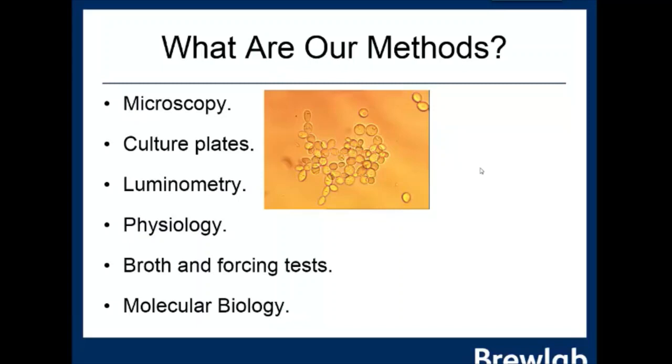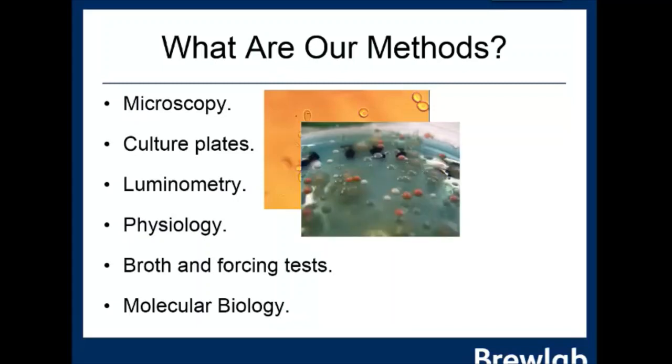But of course, microscopy isn't the only approach that we can take, and sometimes you want to see what's there in a growing condition, what's there at low levels and so on. So we might well use plate cultures. Now here's a plate culture which we wouldn't want to see anywhere in a microbiology lab, but in fact it's from an air settle plate, so it's everything there that would be in the atmosphere. Plates are useful, but they do take time to grow. It could be 5 days, maybe even 7 days, depending on the organisms.